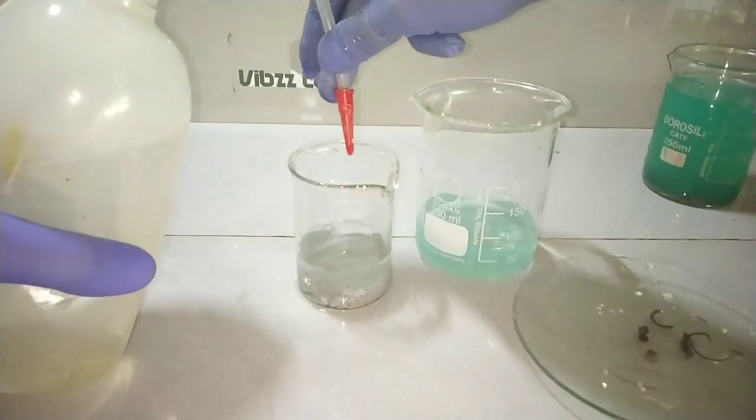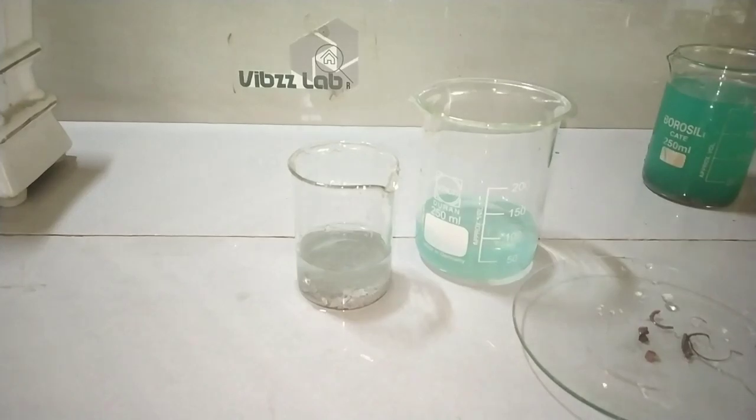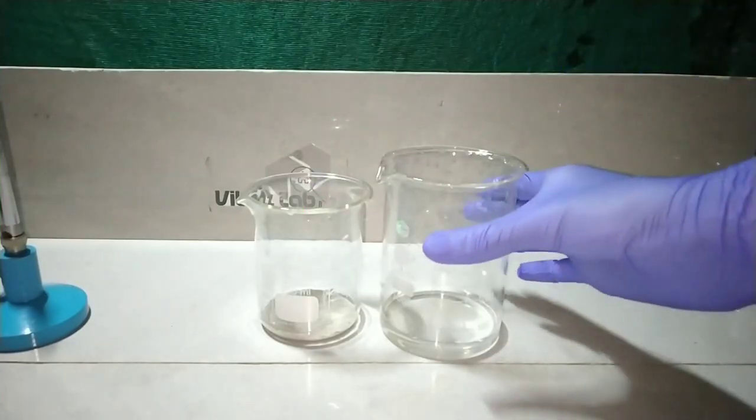After removing all the pieces of copper, I washed the silver precipitate three to four times again with deionized water.